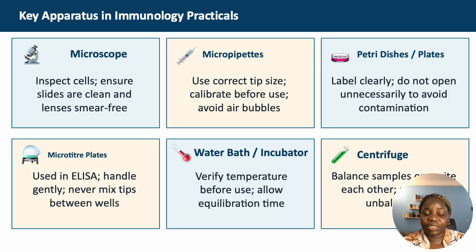Just because you are in a hurry, you collect the pipette from your neighbor, and you miss readjusting the volume you need, and you use the same volume when you are not supposed to use that volume. So always be concentrated, be focused. Make sure you have your material. Check the material every time before using it, and if you are focused, you will remember to change the tips between 2 samples.